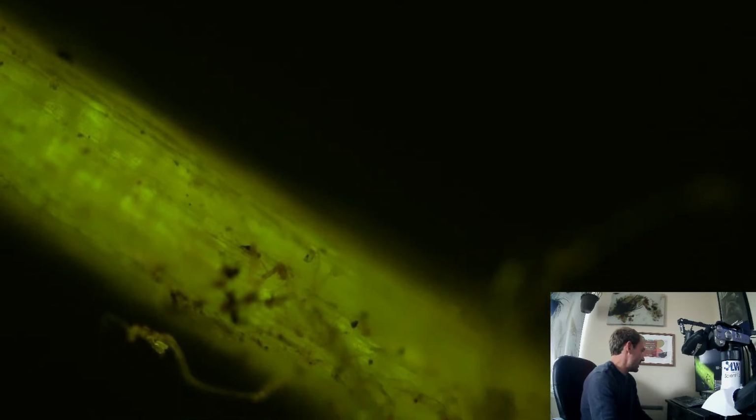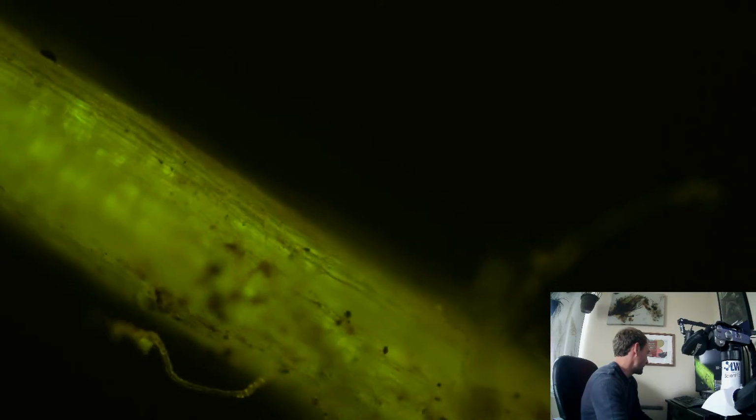You really need stains, as far as I know, from James White to see endophytic fungi and whatnot. But we might be able to see a couple little specks in there that could be. We're only at 100x. We'd have to go in a little bit closer to see bacteria. But right now, we're basically just looking at fungi. And we see a bunch of soil aggregates stuck to the root right there in the middle, those black spots. But as far as figuring out what the mineral contents of those actually are, you would need a spectrometer.